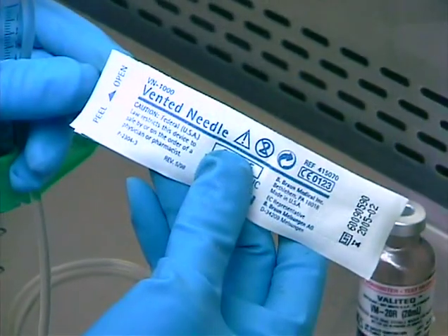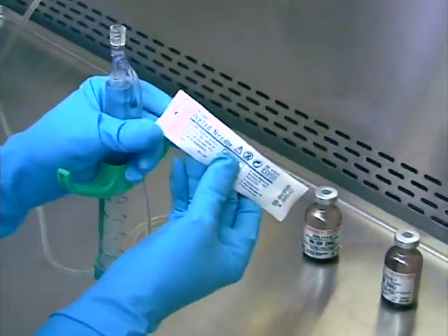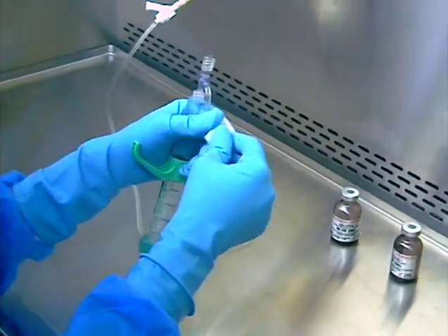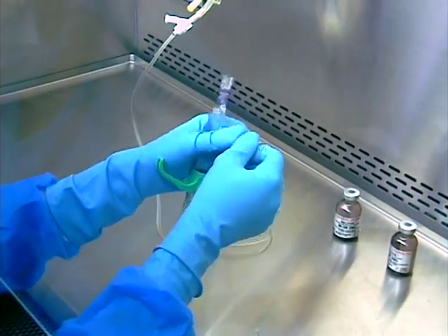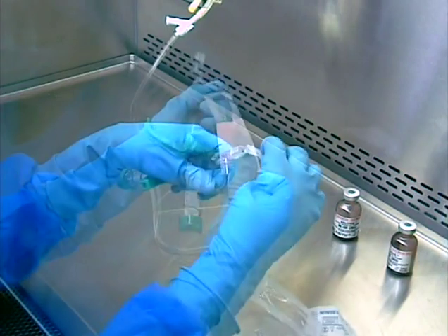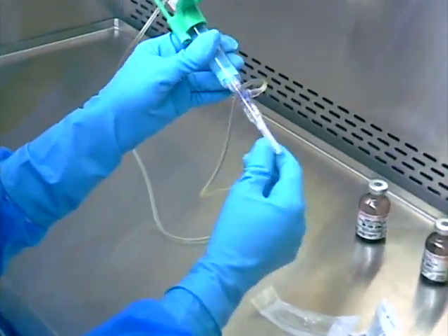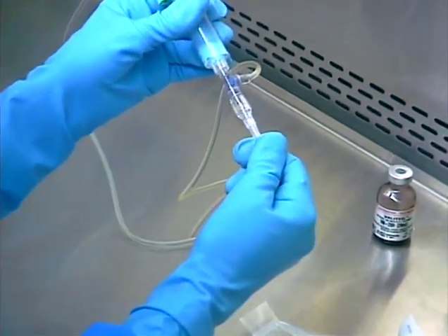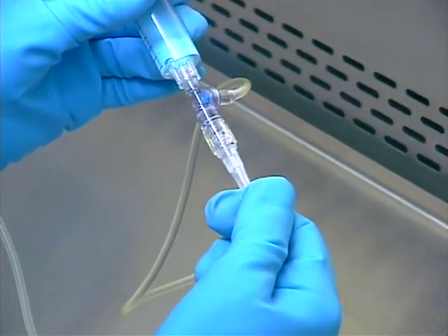Always assume that the dispensing needle on a hanging repeating syringe is used and replace it prior to use. All dispensing with a repeating syringe should be performed using a vented needle or adapter to prevent buildup of pressure in the vial. To avoid cross-contamination and coring, do not reuse needles. Do not use the same syringe and transfer set to dispense different fluids.